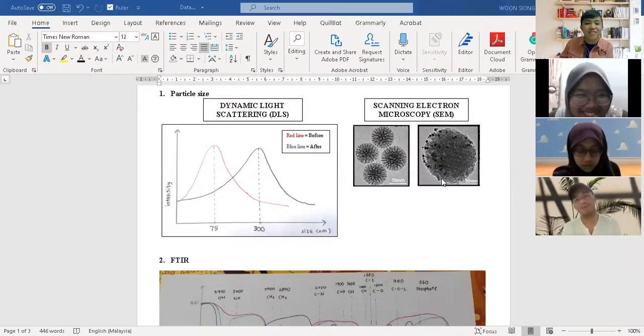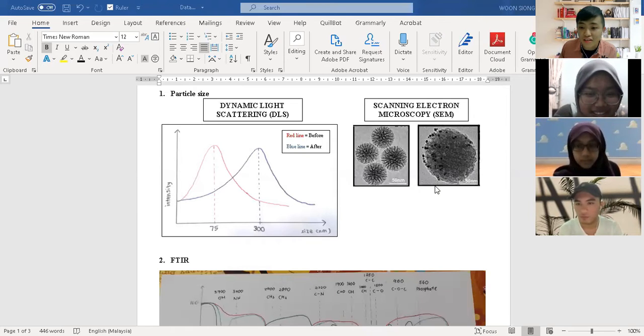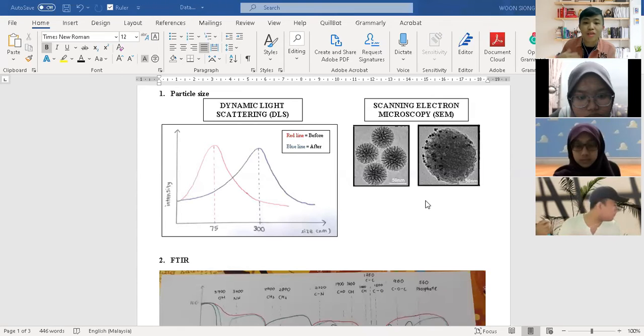So let's start our discussion with the vaccine, which, as we know, uses lipid nanoparticles as the vector to deliver the mRNA so that it can produce the antibody and induce the antibody reaction in our body to fight against COVID-19. All right, so we will see the characterization of this vaccine starting from the particle size.